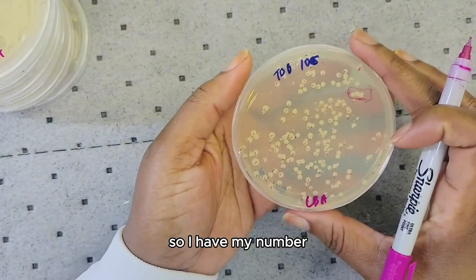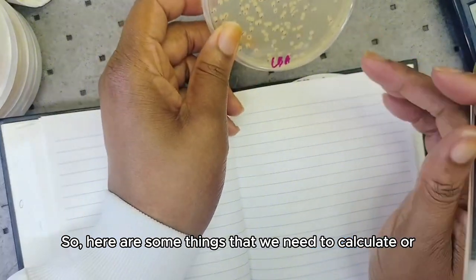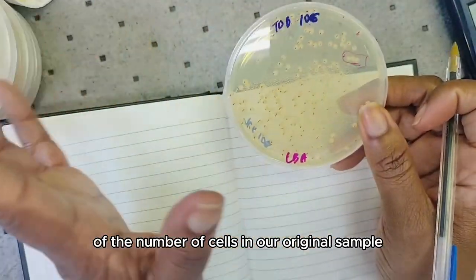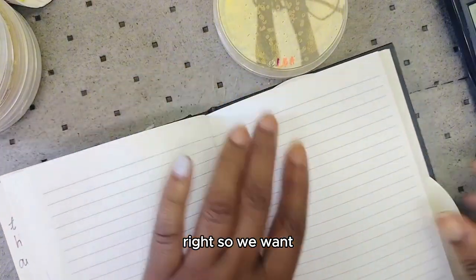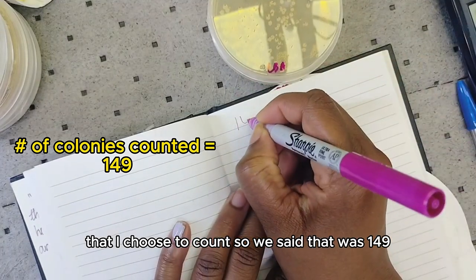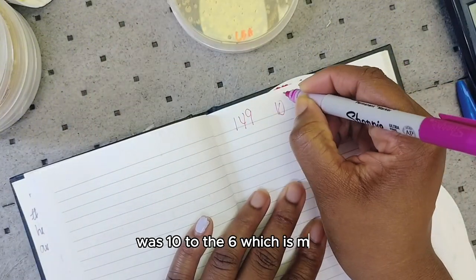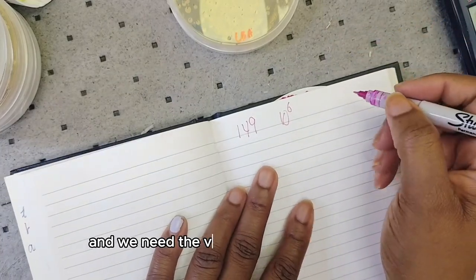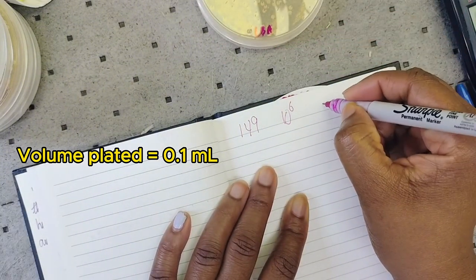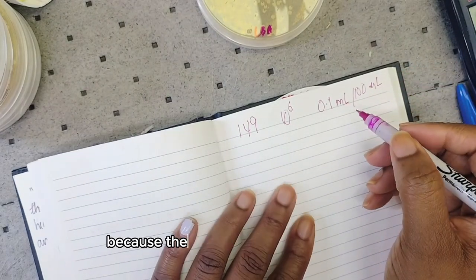Here are the things we need to calculate our estimation of the number of cells in our original sample. We need: the number of colonies counted on the plate I chose — which was 149 — the dilution used, which was 10 to the 6 (one million), and the volume that we pipetted onto the plate, which was 0.1 mL or 100 microliters.